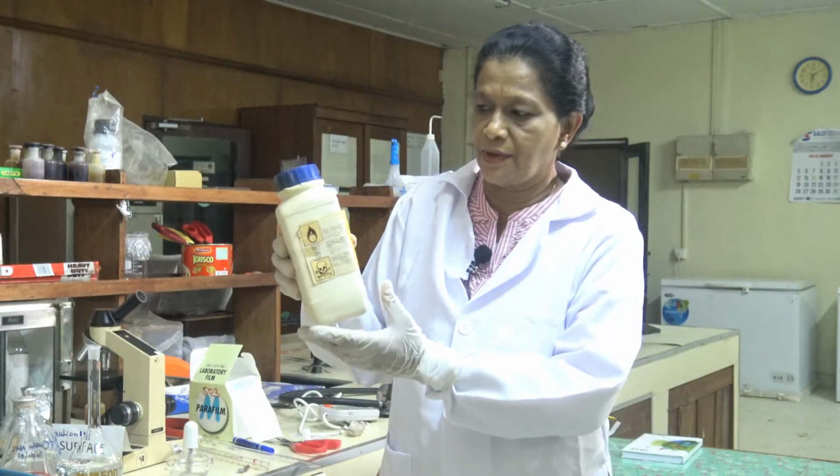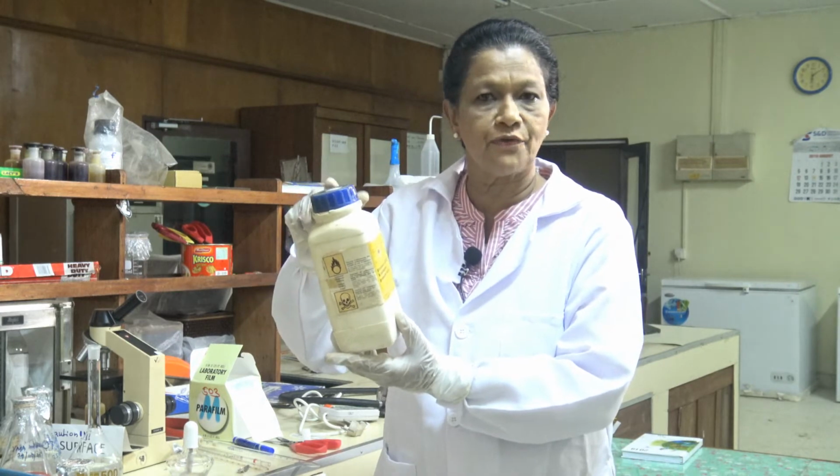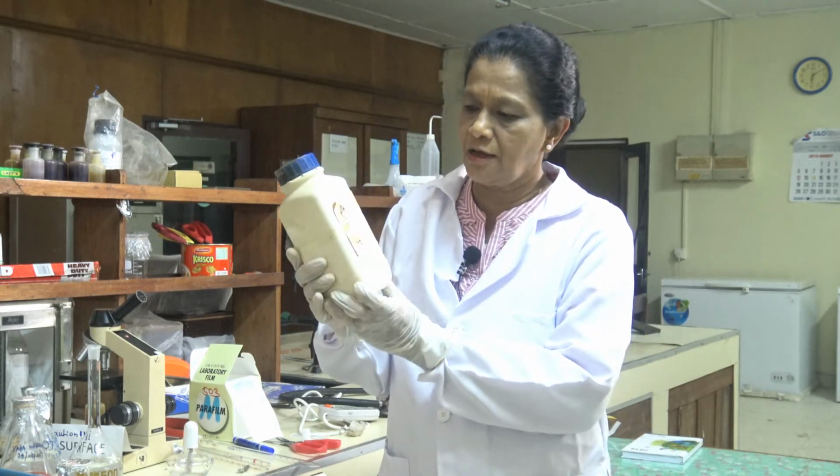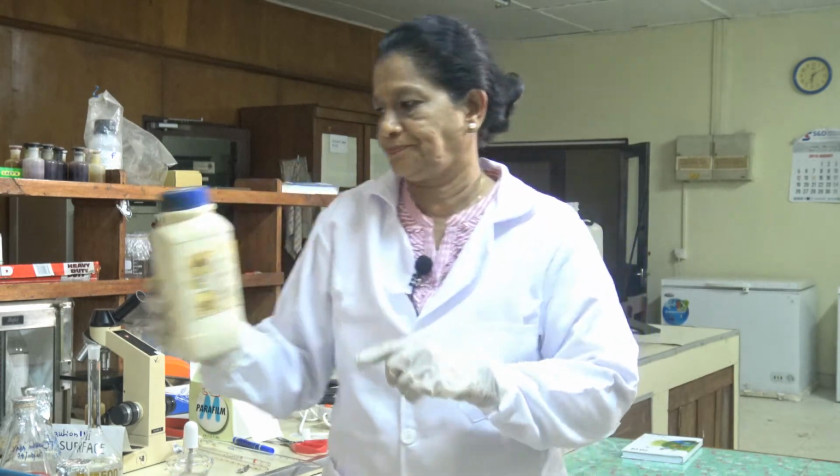Before opening a chemical bottle and removing any of the contents, always read the label twice.